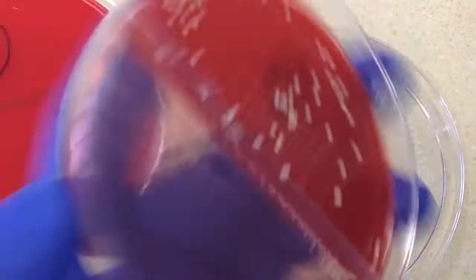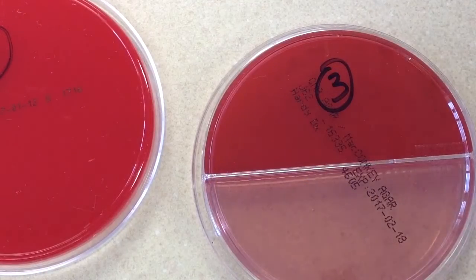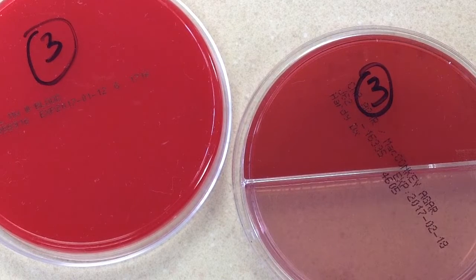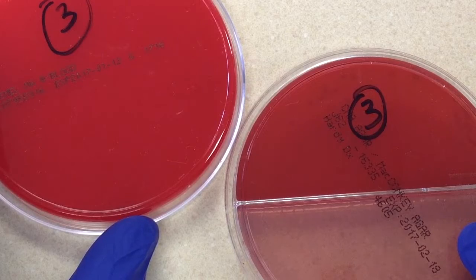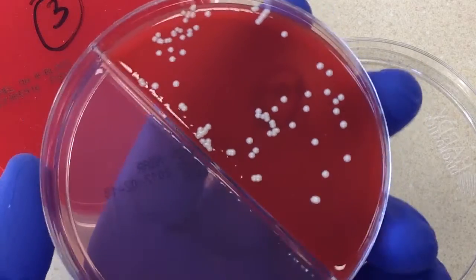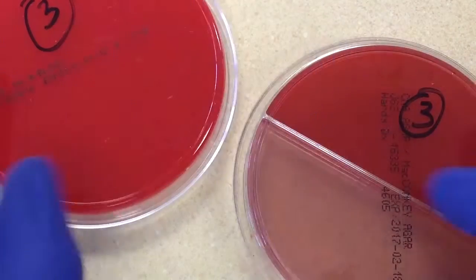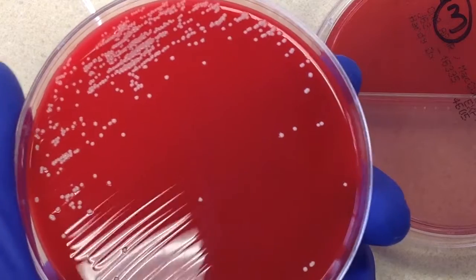Moving to the next urine culture: here's the sheep blood and here's the bi-plate with CNA and MacConkey's. In contrast to the last culture, this one has growth on the CNA and nothing on the MacConkey's. As discussed, CNA is selective for gram-positive organisms and yeast. Looking more closely, it appears to be a single colony type, not a mixed culture, so we can proceed with identifying this organism.